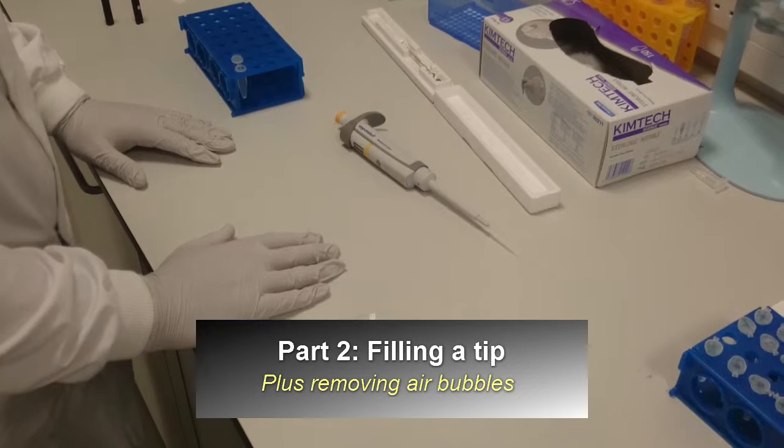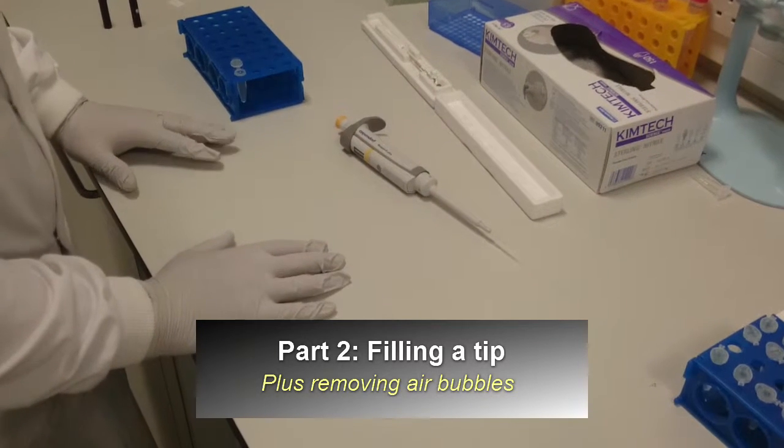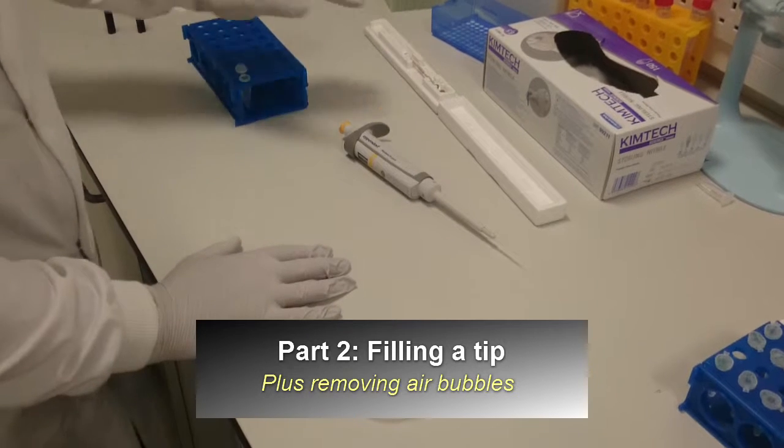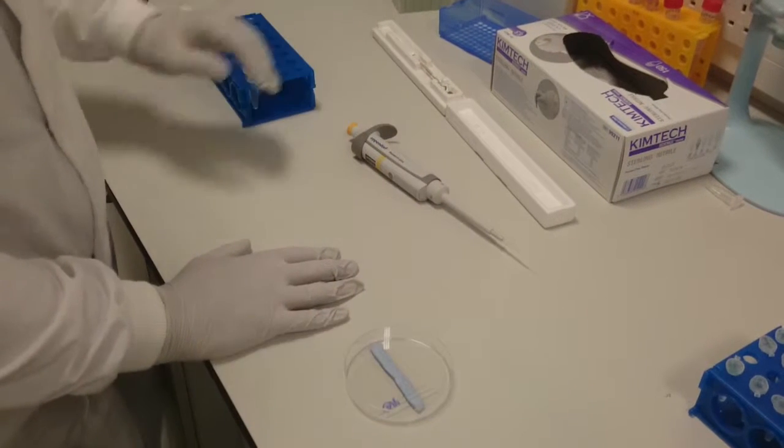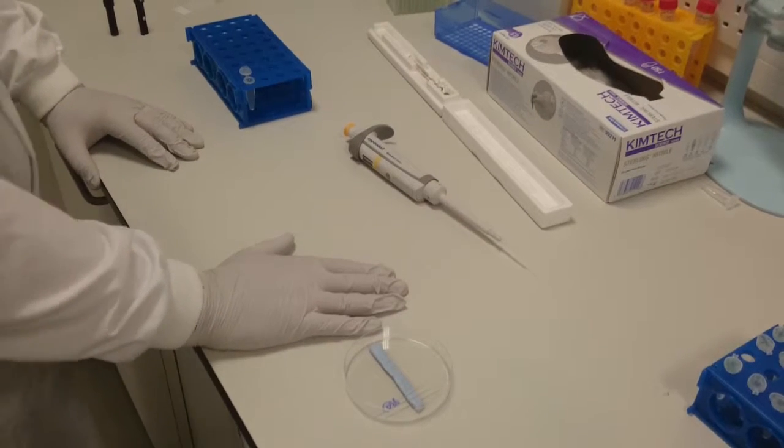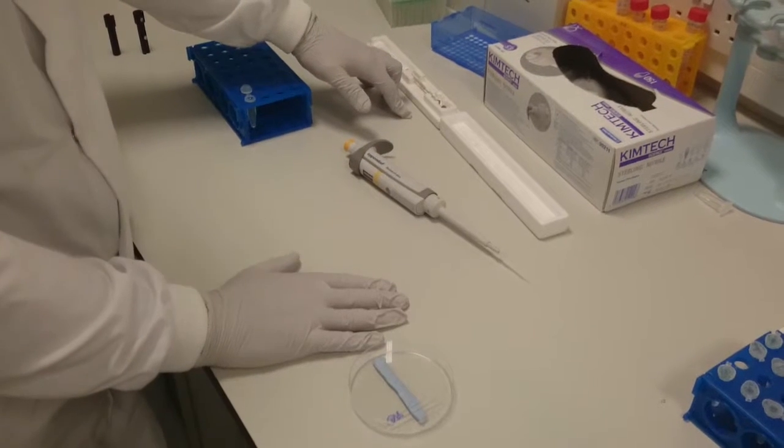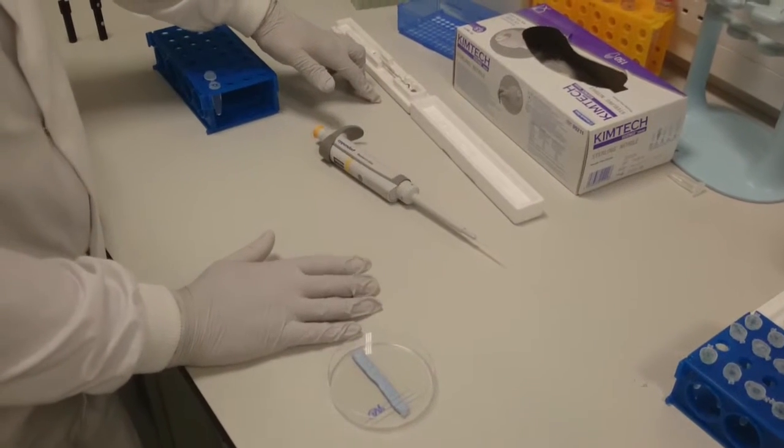Now we've pulled our borosilicate glass tips, I'm going to show you how to introduce sample into them ready for the instrument. I'm going to show you two methods. The first method is using the Hamilton syringe. The other method is using the gel loading tips. Both have their advantages.